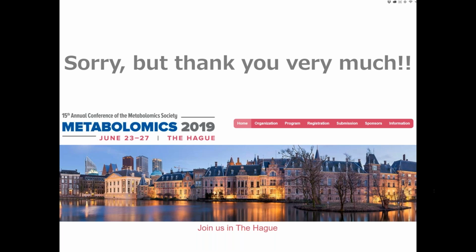That's why I use the M+H and M-H spectra for annotation purposes. But if I would like to do quantification of a metabolite, I sometimes use the sodium adduct type, something like this.